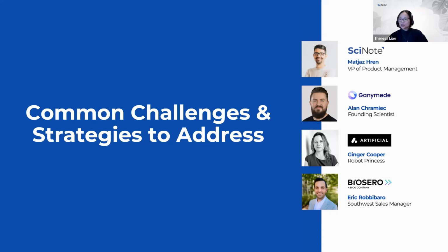Up next: we've talked about automation and its definition, and how the field is shifting to a heavy focus on data and software, and on how to get hardware to talk to each other. We also talked a little bit about the human being part of the equation.